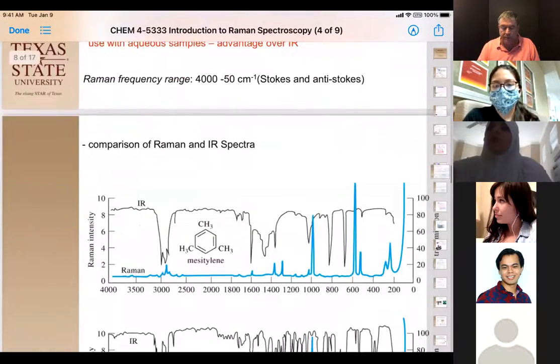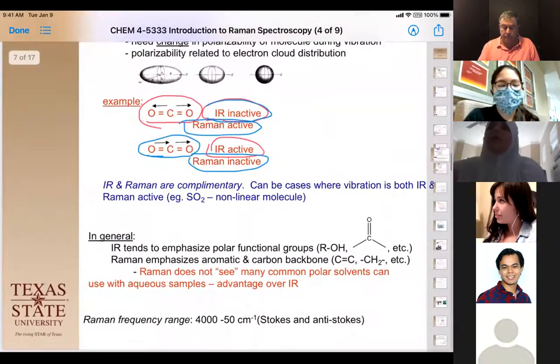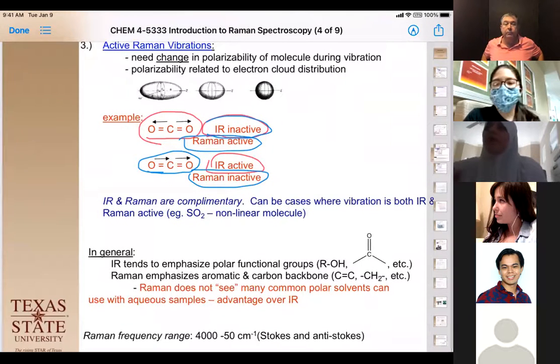Okay, so the fingerprint that we can't read in IR, we can read it in Raman spectroscopy. Well, the fingerprint region is all of those unsymmetrical stretches for carbon, oxygen, and all those single bonds between all the different elements, except for hydrogen, are all going to be down there. And it could be a lot of them, there could be wags or wiggles or rocking motions. Those all show up in different places in the fingerprint region of the IR.